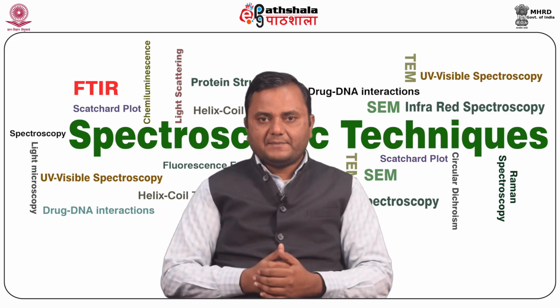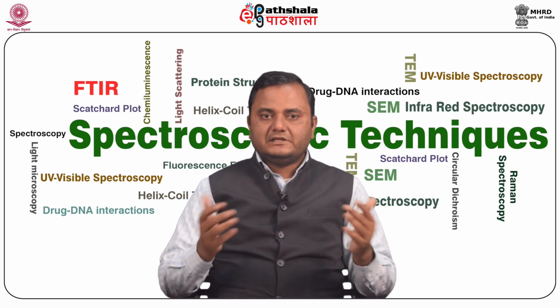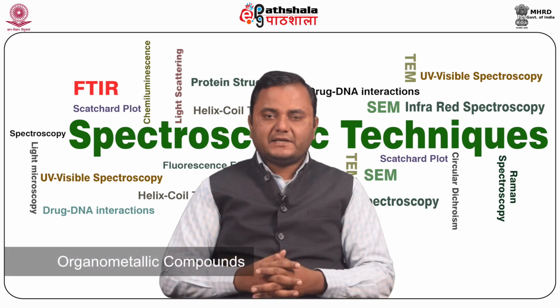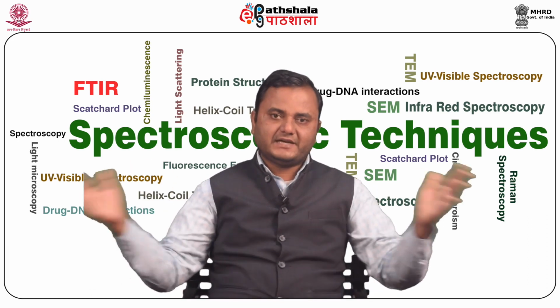This technique is widely applied in the analysis of organic materials. It is also used for polyatomic inorganic molecules and for organometallic compounds in the different IR regions.